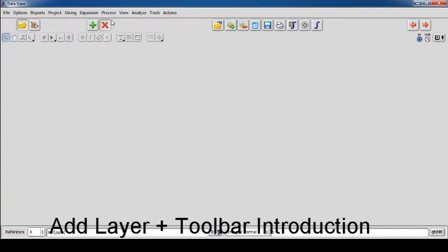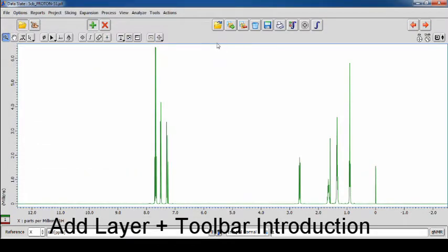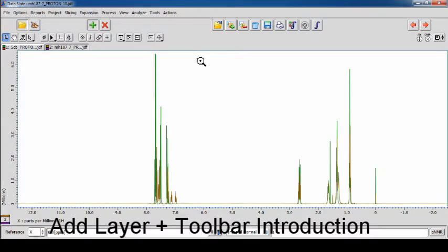In the top right corner is the toolbar. These tools mostly deal with the geometries themselves, rather than the data inside them. The first tool is Open Data as Layer on currently selected geometry. This tool will allow you to open a data file as a different colored set of data, or layer, on the selected geometry. This can be useful for comparative purposes.